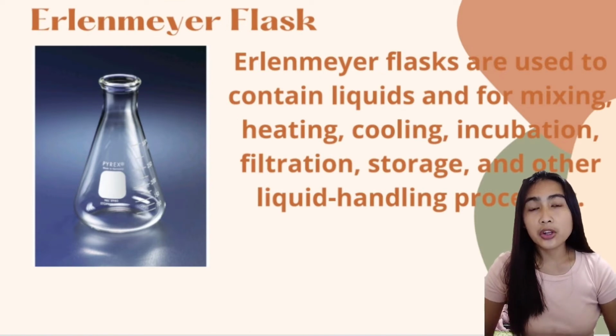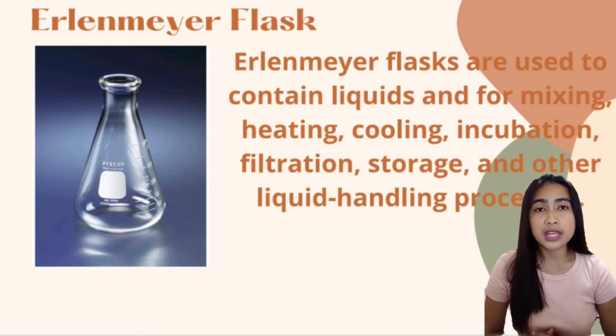Next is the Erlenmeyer flask. Erlenmeyer flasks are used to contain liquids and for mixing, heating, cooling, incubation, filtration, storage, and other liquid handling processes.